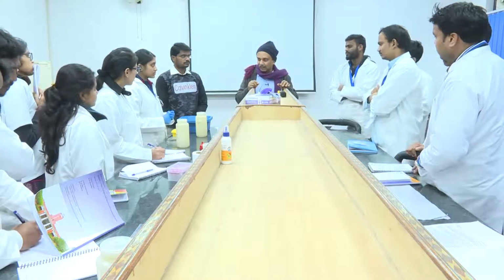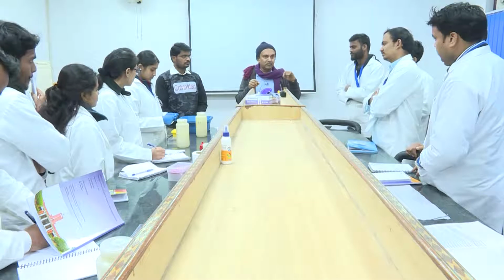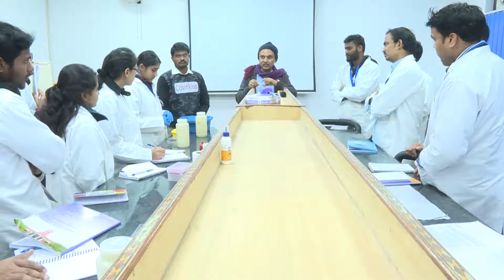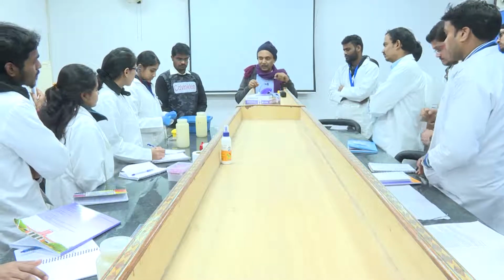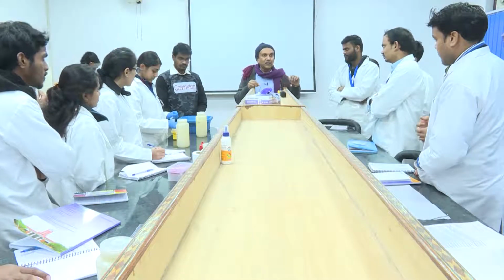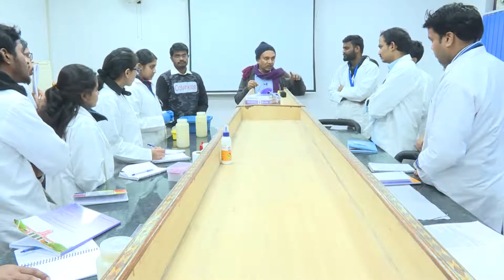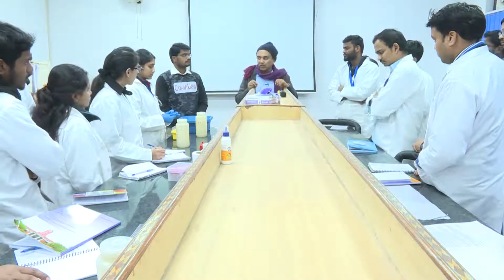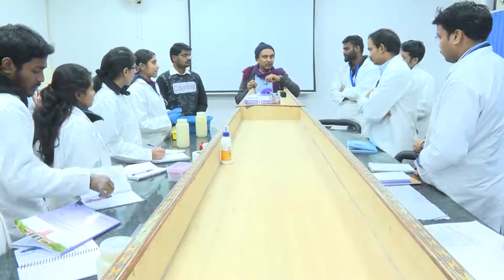In today's class, I think Ilekya would give you the DNA sample which has been quantified using nanodrop. So we know the amount of DNA present in that sample, and you also will be given primers, 2 sets of primers. You use the standard protocols, and then calculate the amount of primers to be used in the final reaction. Normally we use a 20 microliter reaction, so we quantify the primers which are required for that.